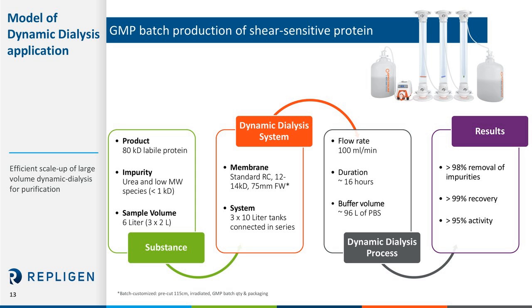Thanks, Danny. Hello, everybody. My name is Cassidy Markee, and I'm the director of the dialysis division and have quite a bit of experience with the dynamic dialysis process application and development. So I'll look at a model of a dynamic dialysis application to help you understand how this translates to your practical application. As Danny mentioned, every application is going to be different, and every application will need process development. So it really is a good place to start with a model and then fine-tune it to your particular application.